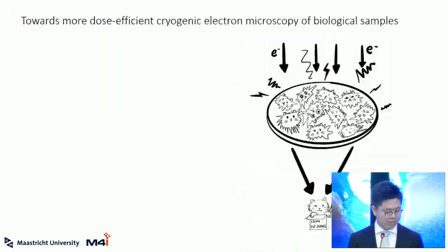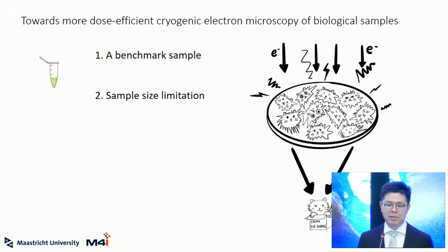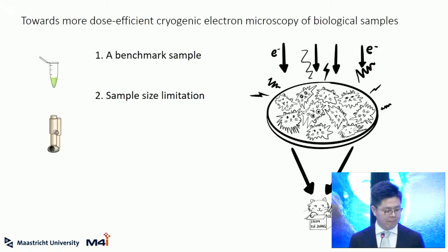need to improve. So here we come to the main topic of my thesis, towards more dose-efficient cryogenic electron microscopy of biological samples. We will first talk about the sample. We introduced a benchmark sample to characterize cryo-EM hardware and software development. We also discussed the sample size limitation, how small a protein can be studied by single particle analysis cryo-EM. And then we talk about a very important issue with imaging non-conductive specimens, which is charging, in the electron microscope.